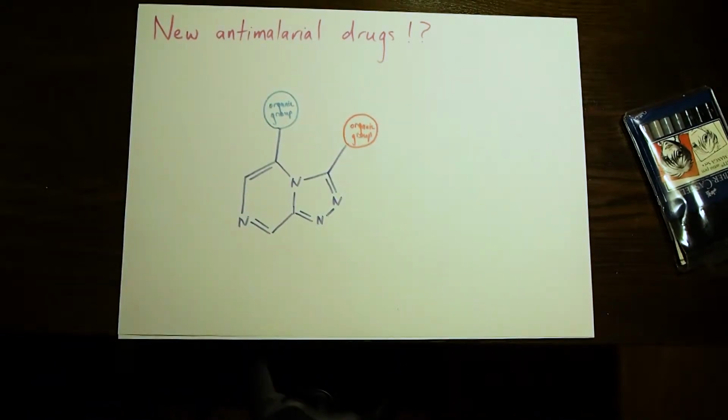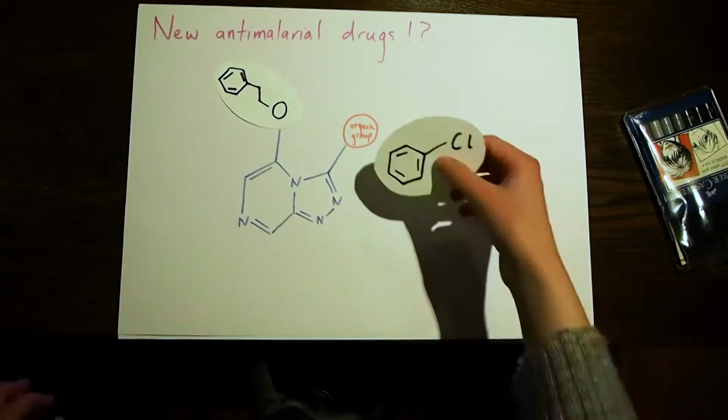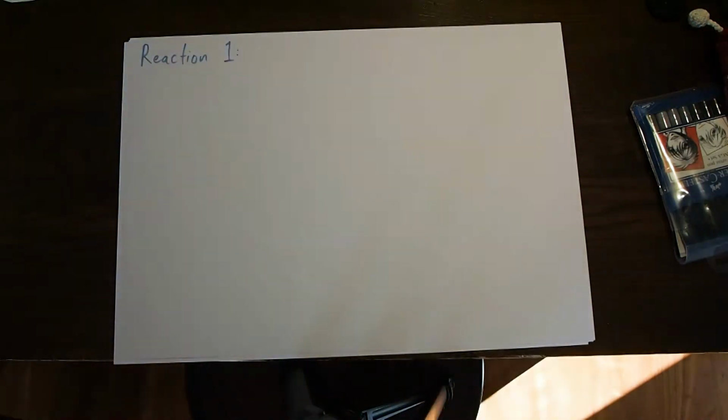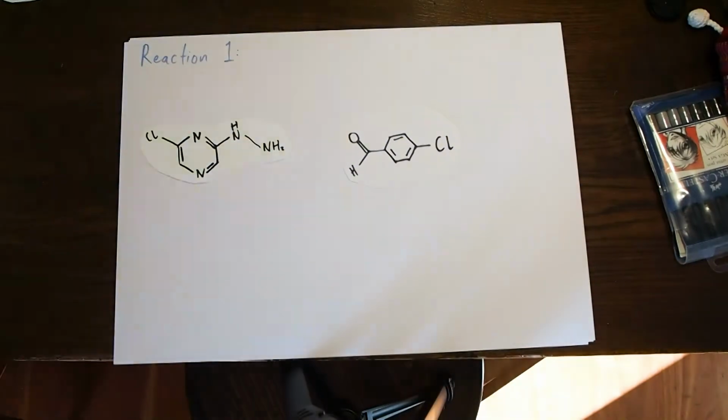We used the technique of thin-layer chromatography to track the progress of each reaction across the synthesis process. Our group made a previously synthesized molecule as the control, which was important in verifying that the procedures followed were valid and that any unexpected results were in fact properties of the new molecules. We first made the triazolopyrazine core and added the first functional group.